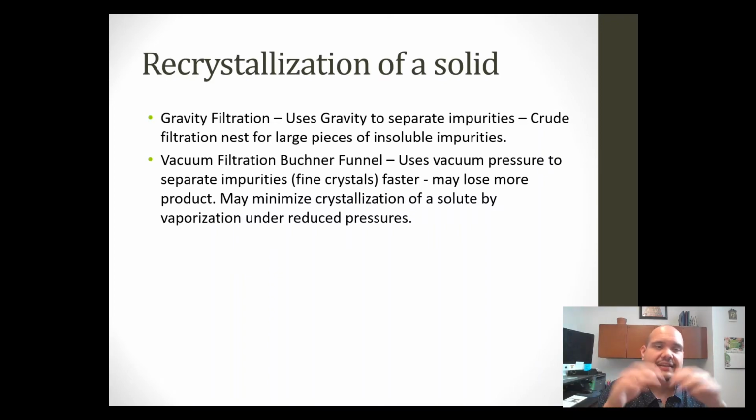At that point, if you did a good job, the crystal that you now have should be pure. If there are any particulates, you would have to recrystallize again. Make sure you do a gravity filtration this time and then a vacuum filtration. So it just depends. If your impurities are not soluble at high temperatures, gravity filtration is the way to go. If they are, then you can skip gravity filtration and go right to vacuum filtration. Again, if you're not sure, ask your professor.